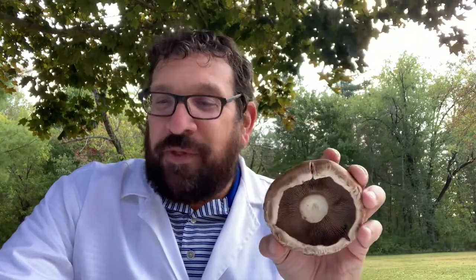Another reason is it gives you first-hand experience with some organisms that you may not normally get up close and personal to. In another lab, we looked at protists. Those protists aren't something you normally get close to and involved with, but we did in that lab. Well, same thing with the fungi lab. Often you don't get up close and personal with the mushrooms growing in your yard or on the side of a tree or on your bread, but we are with this lab.